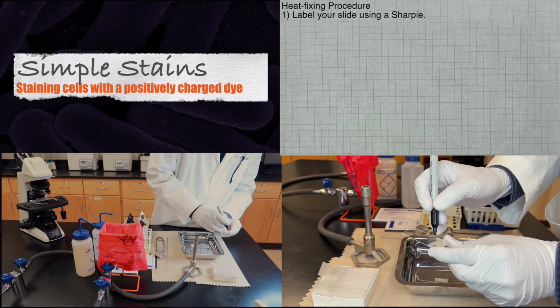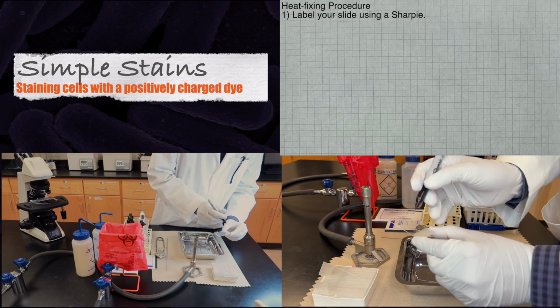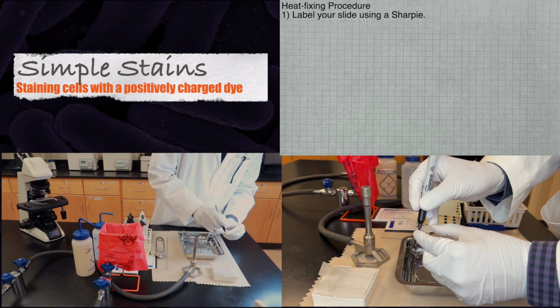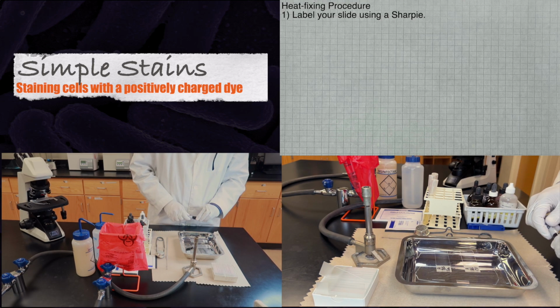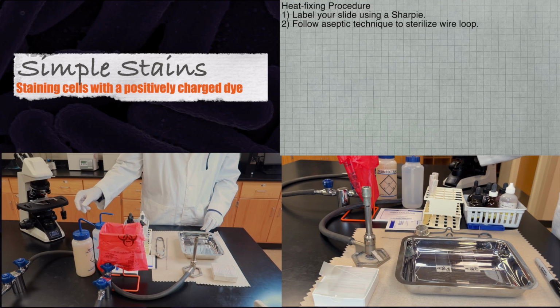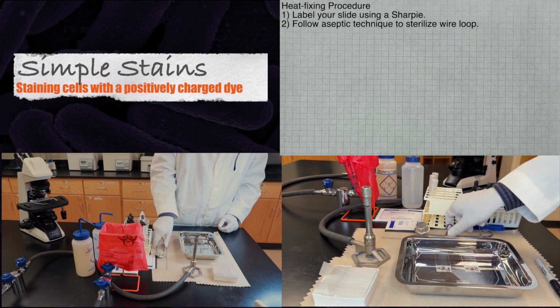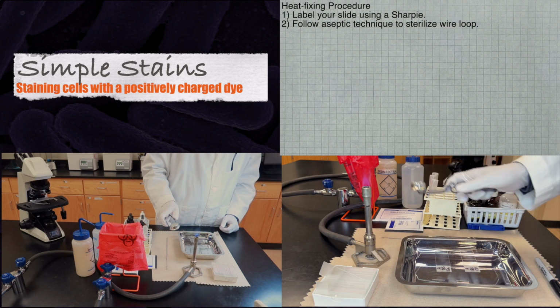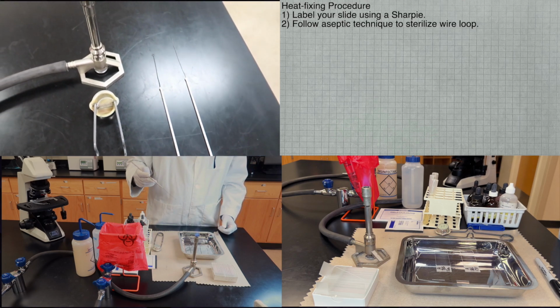In order to prepare the bacterial smear and perform the heat fixing, please follow the following steps. First, label your slides using a Sharpie. Next, please follow aseptic technique to sterilize your inoculating loop, as you have previously learned in the class and as is being demonstrated here.